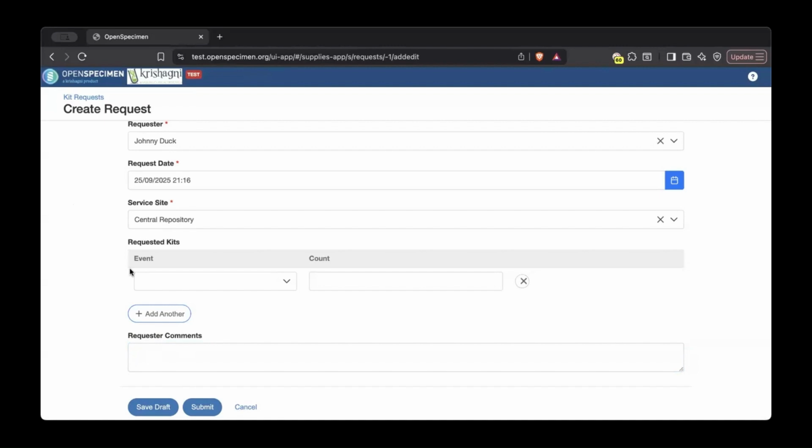Can the supplies cost be linked to the shipments and not just the kit we charge for? Yeah, so right now we are not doing anything about cost in the kits or the shipments. So there is no aspect of cost in this, so that still has to be handled outside the kits module. But if there is any specific comment on the cost, enhancing the kit module to handle cost is something that we can discuss with you. But as of today, the kits module does not do anything around cost or charge or money or whatever.